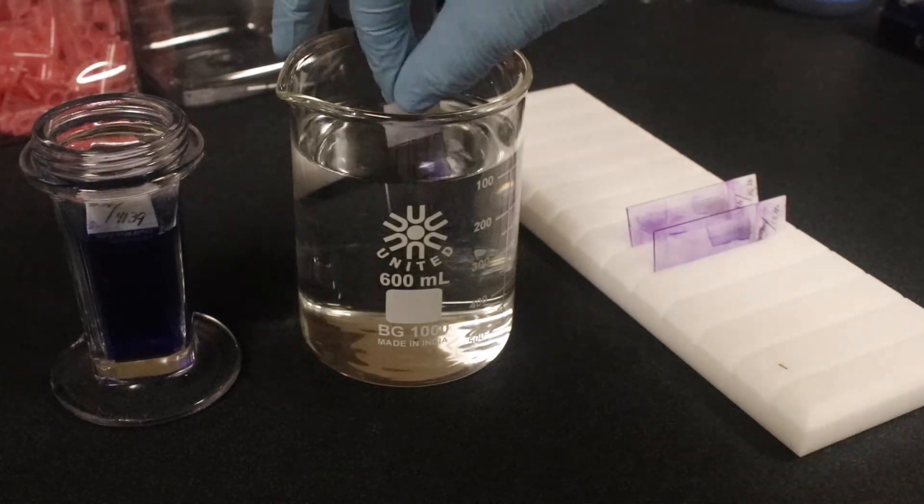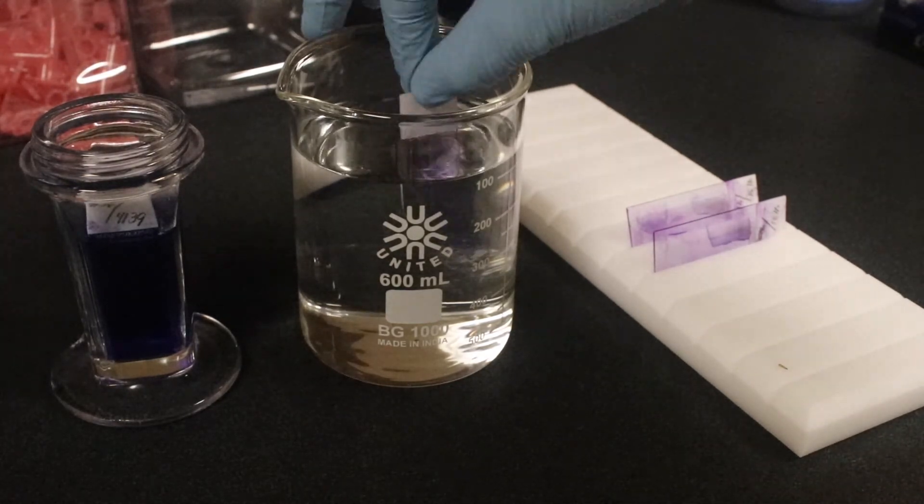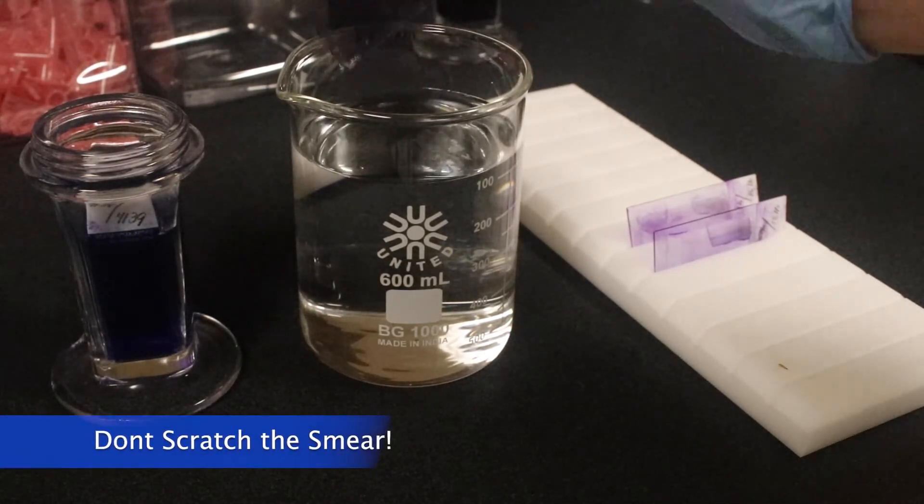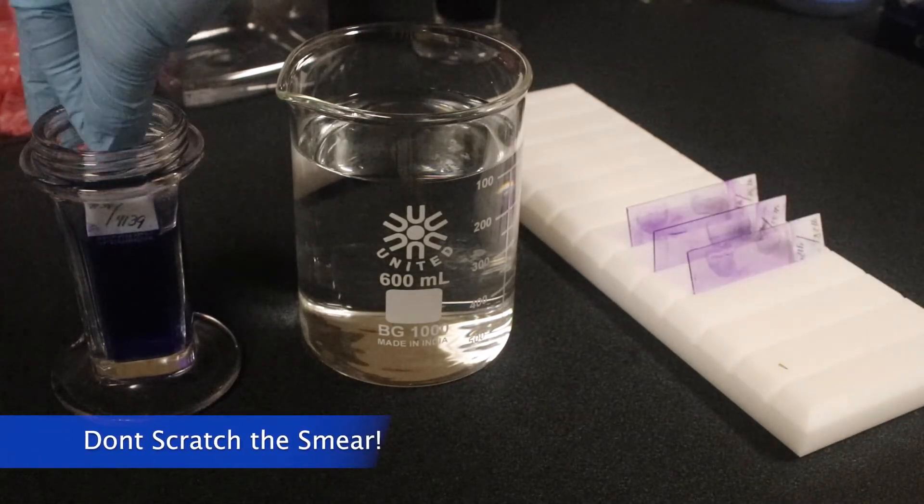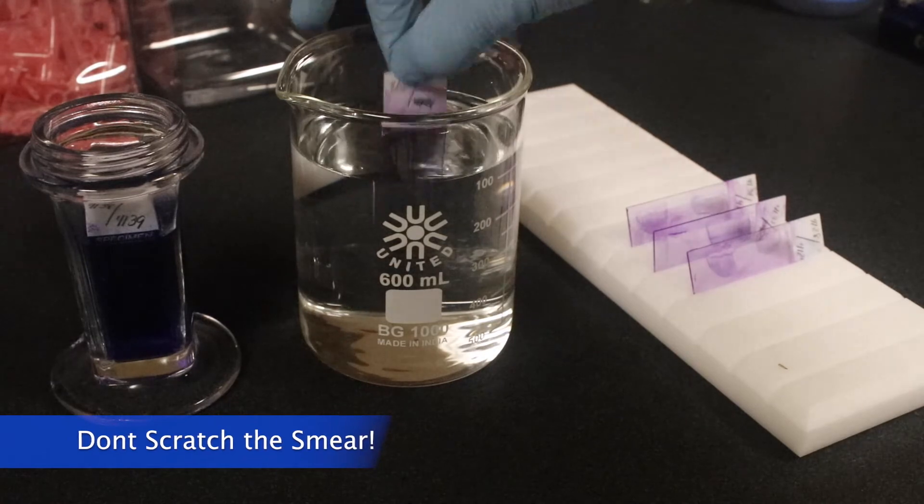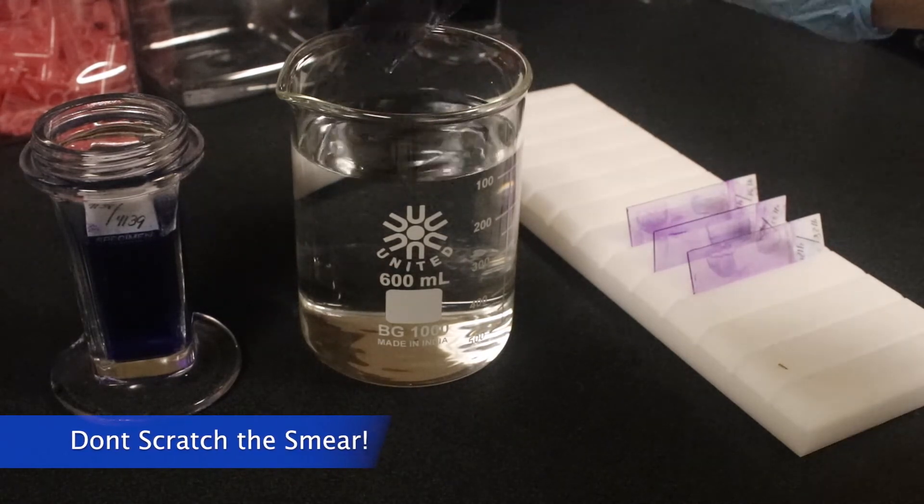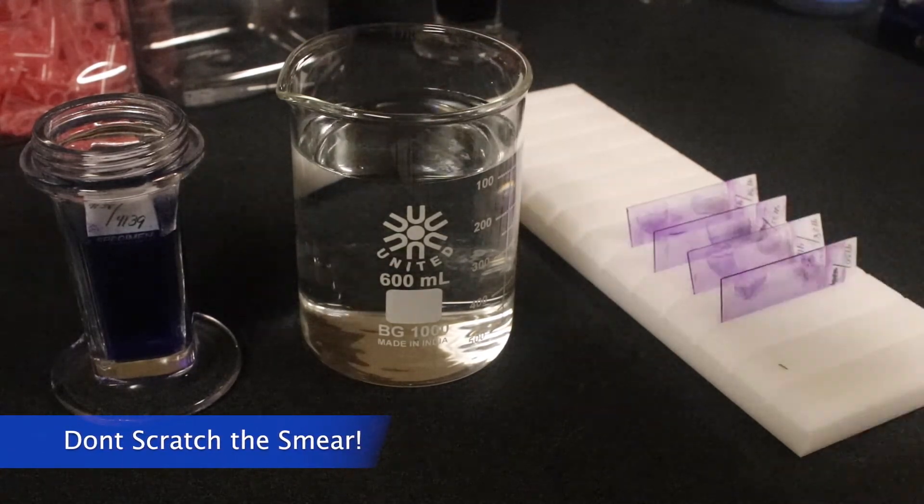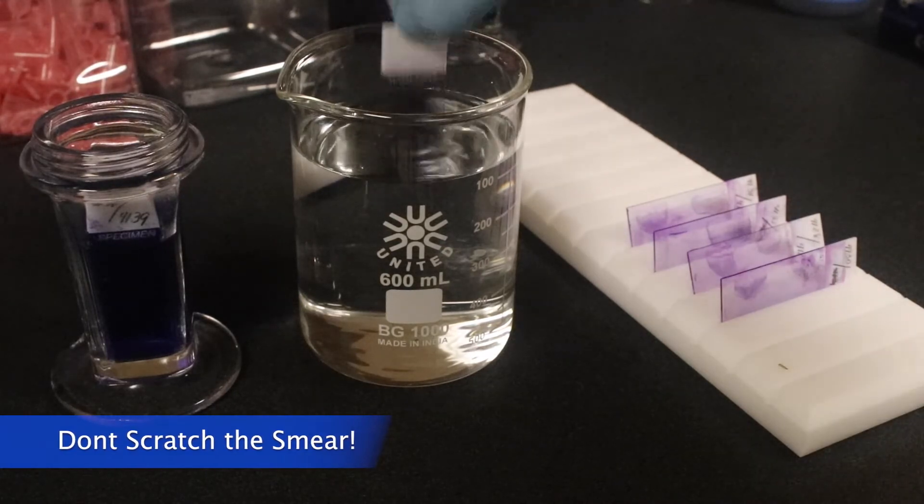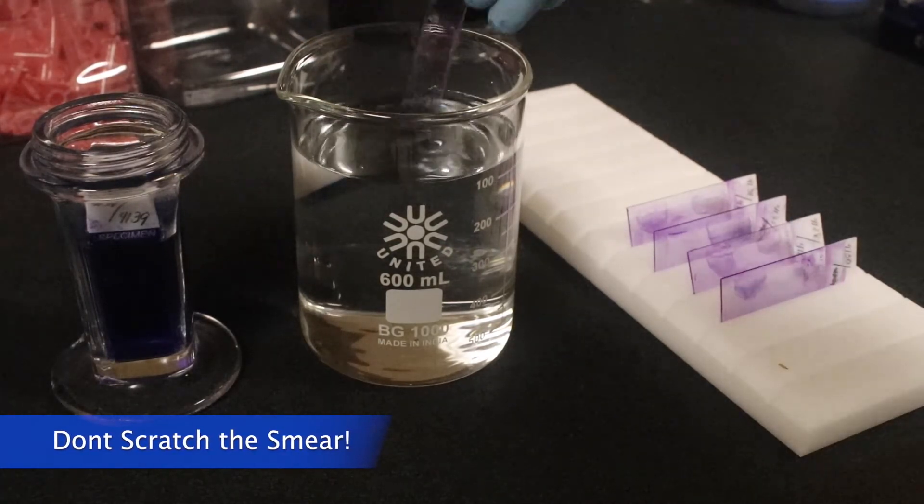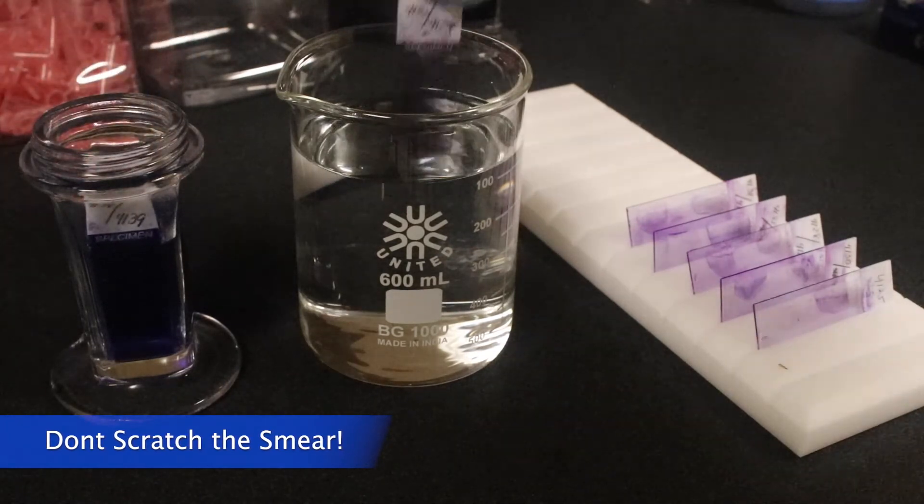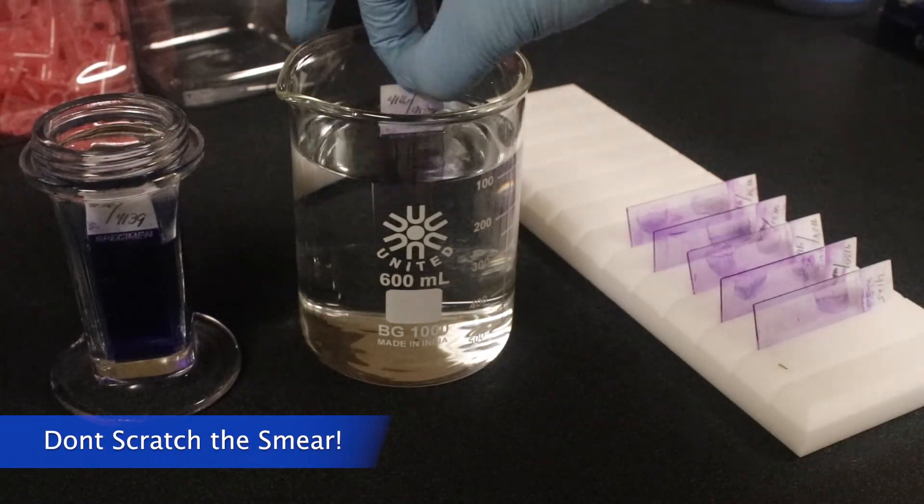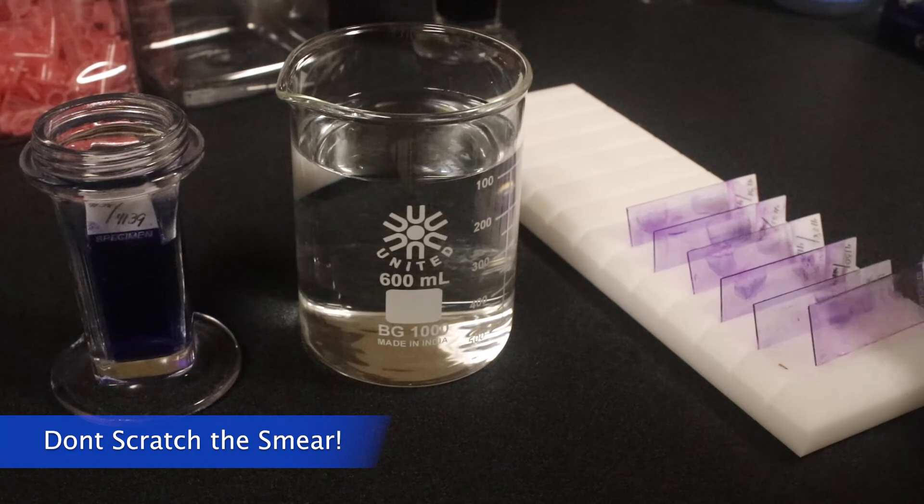Now, it's really important that when we're placing them on the drying rack, we're going to orient them so that the smear is not at the bottom because we don't want to scratch off any of the cells that we have on our slide. So just make sure that the side that doesn't have smear on it is the one that's going on the bottom.